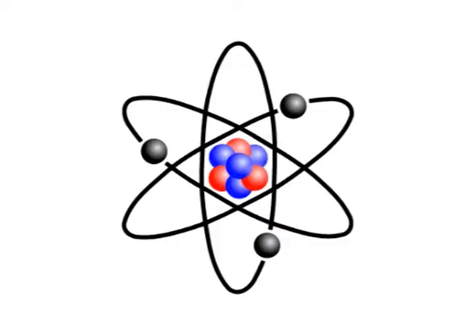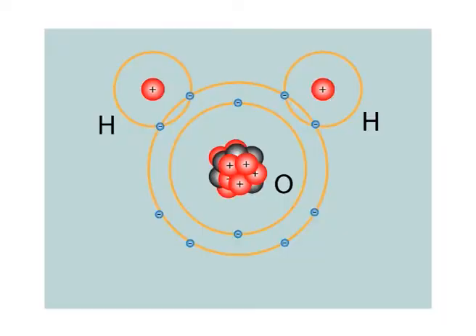In a simplified atomic model, in normal condition, the electrons remain in their original orbit, but when an external source of energy stimulates them, they absorb it and jump to a higher energy orbit. The electron has a tendency to return back to its original orbit. During the return journey to their accustomed orbit, electrons release excess energy in the form of radiation. This phenomenon of absorption and relaxation of external energy causes fluorescence. The fluorescence ceases as soon as the external energy source is removed. It is an instantaneous phenomenon.